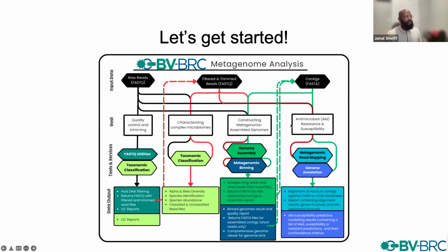Lastly, we'll cover something that's a little extra. It's not per se related, but still something you might be interested in. Maybe you're interested in looking at antibiotic resistance genes within your metagenomic sample. We can use the metagenomic read mapping service, which will align our reads, or your contigs, against the comprehensive antibiotic resistance database.